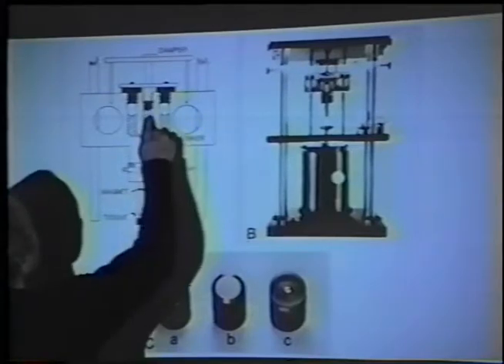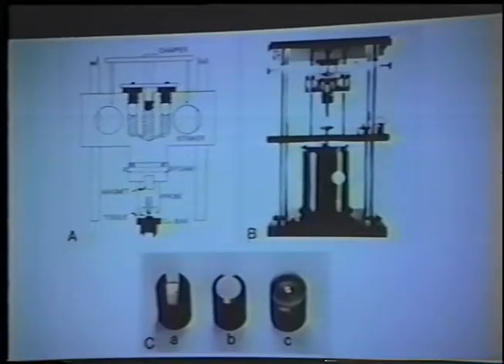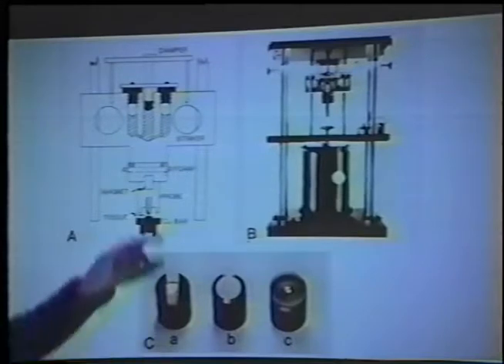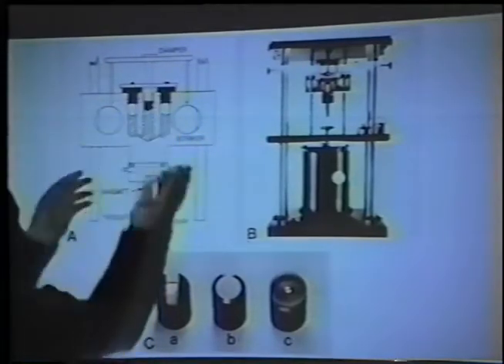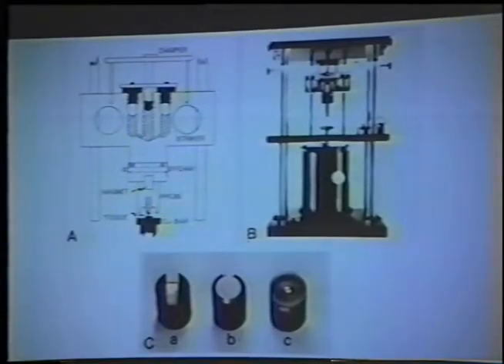The damper is pushing on the glycerol, and the damper moves down and compresses the air in the side compartments through the glycerol long enough to keep the striker from rebounding. And then the system resets afterwards because these air bubbles push the damper back up. But in this case, it's a dynamic sort of system, in that you're using a moving mass pushing down on the striker to keep it from rebounding.